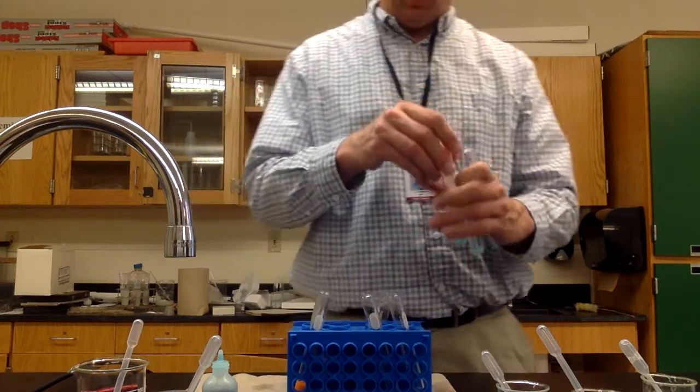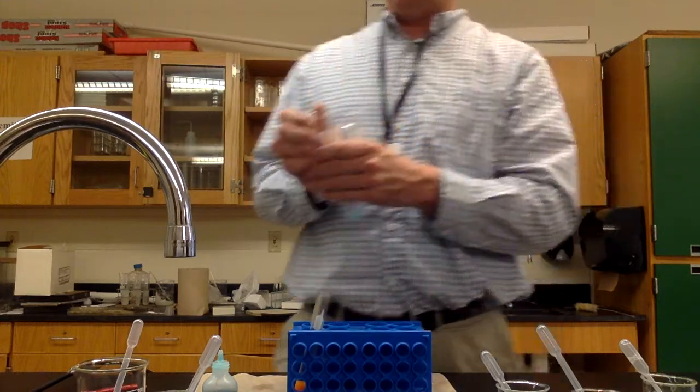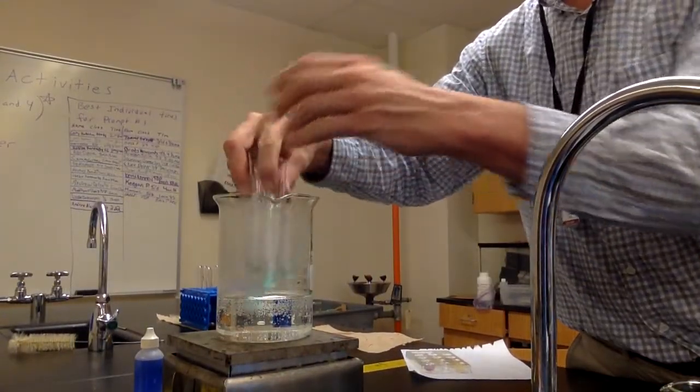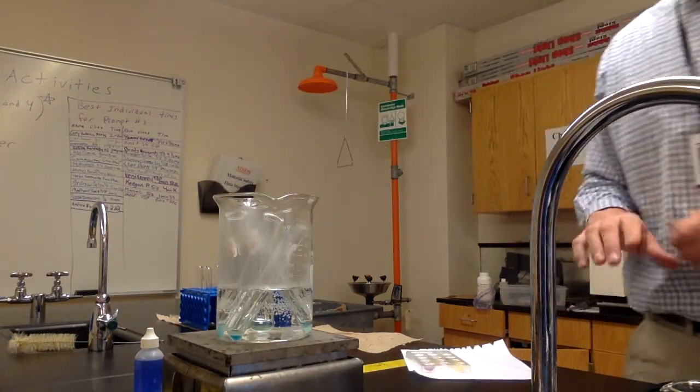Okay. I want to put them all in the water at the same time. In this water over here at the same time. Because if we put them in at different times, we wouldn't be able to control that. So one of our controlled variables is the amount of time. And we're going to watch this.